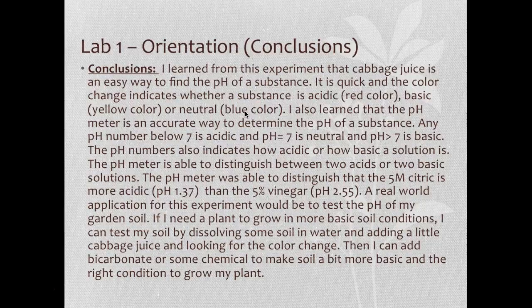So both the pH numbers and the cabbage indicator were helpful in determining which solution was neutral, which was acidic, and which was basic. And the pH meter was able to give finite numbers, which helped to explain the strengths of the acid and the strength of the base and so on.